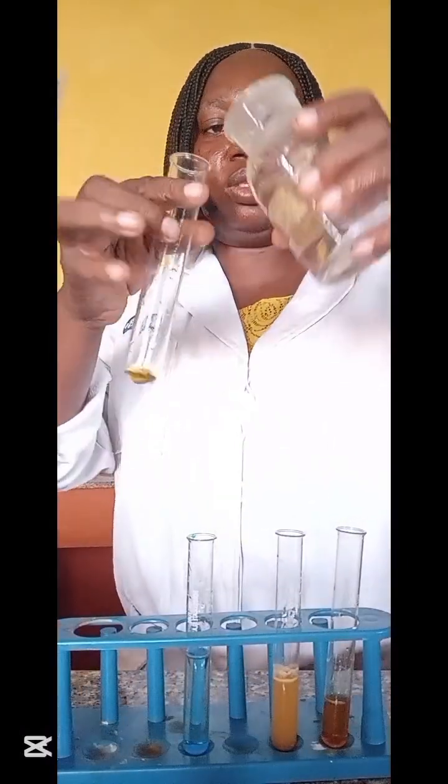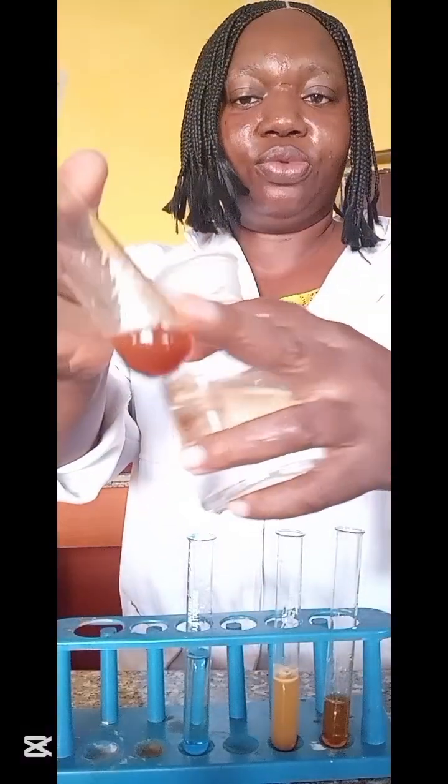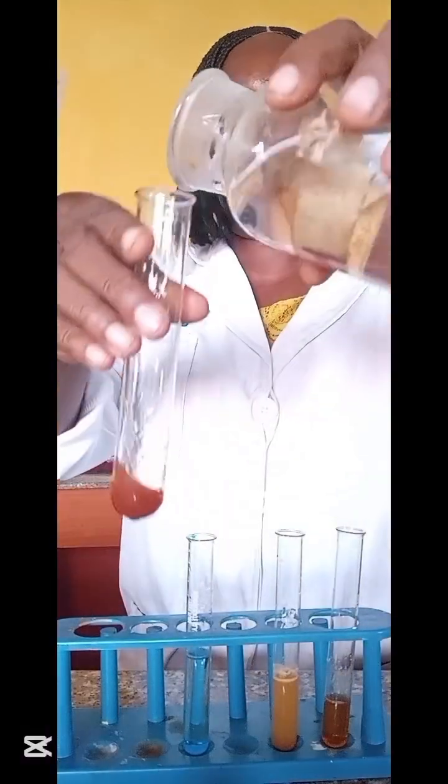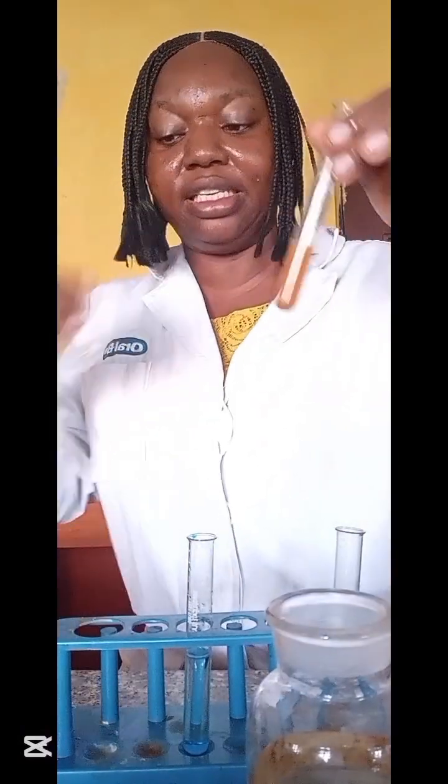Let's test it with ammonia. A reddish brown gelatinous precipitate. In excess, the precipitate does not dissolve. Whether it's sodium hydroxide or ammonia, the result is the same: reddish brown gelatinous precipitate, insoluble in excess ammonia, insoluble in excess sodium hydroxide. Some iron 2 can also be reddish brown in color, but how we distinguish it is when we test it.